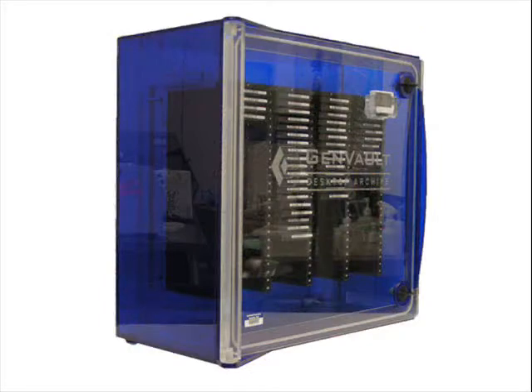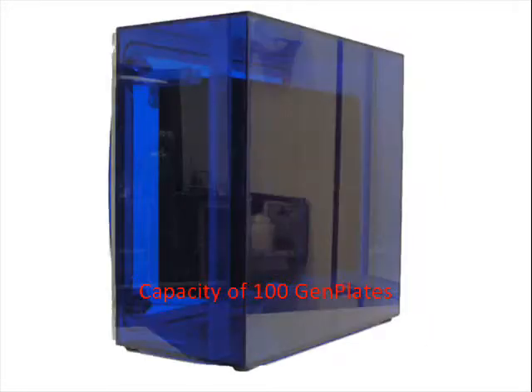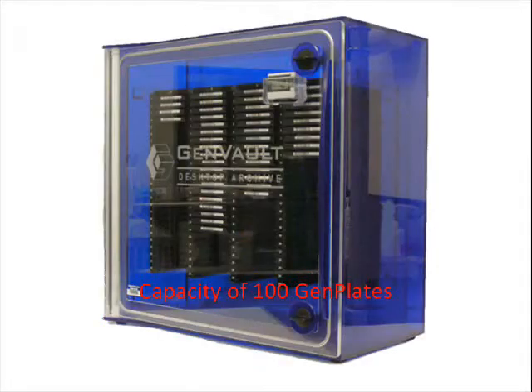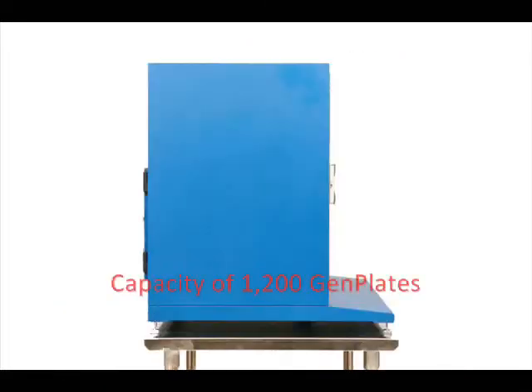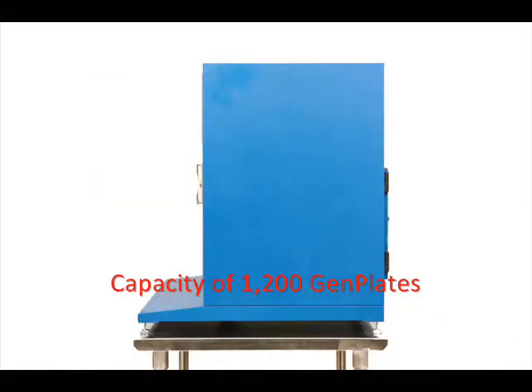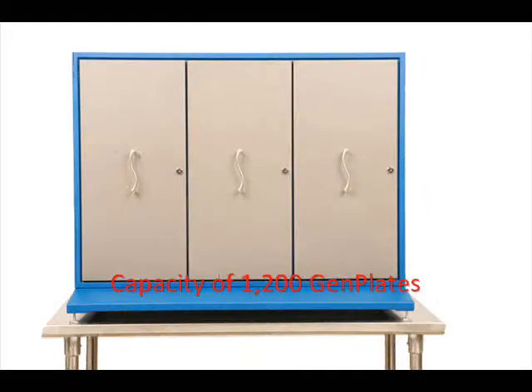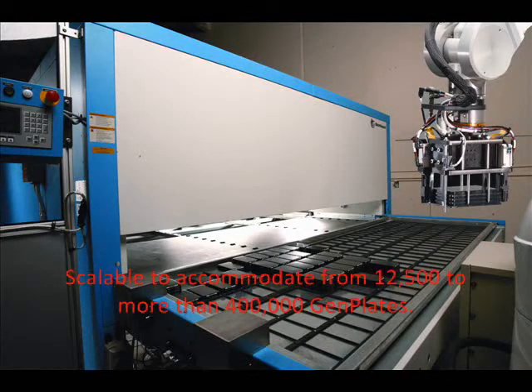GenVault's desktop archive, our small store, holds up to 100 GenPlates. The personal archive, our medium store, holds up to 1,200 GenPlates. Our dynamic archive scales to meet your needs, with sizes beginning at 12,500 GenPlates, up to more than 400,000 plates.